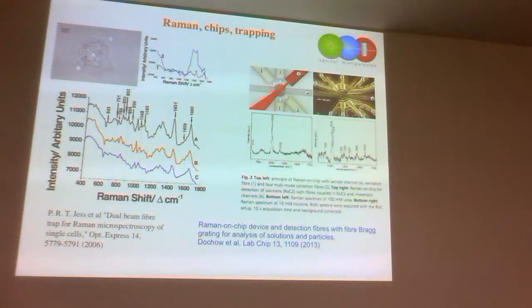So, jumping back to the previous one. Do you think the next step could possibly be an in vivo test like that, in the same way that in vivo flow cytometry is being worked on? That's an interesting question. I'll just repeat it: could this be a precursor to in vivo flow cytometry or in vivo testing, stretching cells in vivo? The problem would be that the flow of cells in your body is so fast that it's going to be very hard to track.